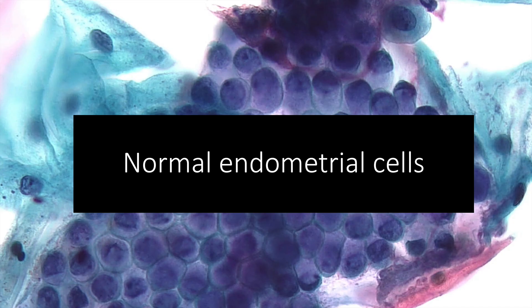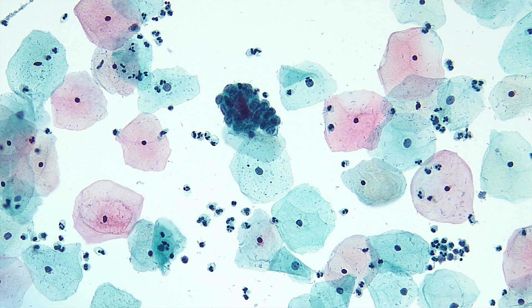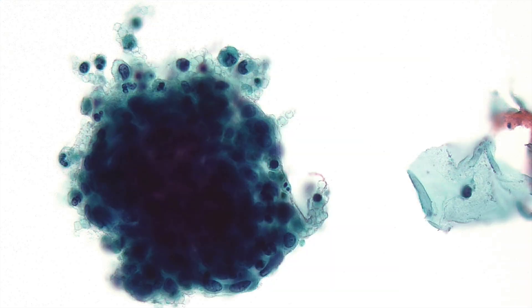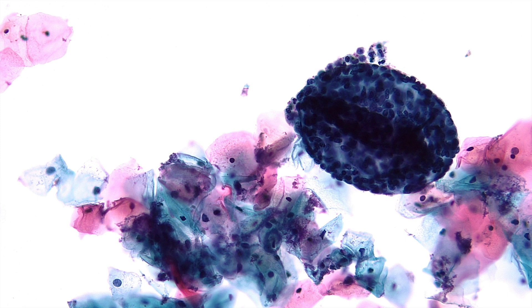Now we'll discuss normal endometrial cells. Normal endometrial cells are smaller than endocervical cells, with nuclei about the same size as an intermediate squamous cell. The nuclear chromatin can be dense and heterogeneous, and does not contain prominent nucleoli. These cells have scant cytoplasm. Intracytoplasmic neutrophils are characteristic, and classically, endometrial cells shed in tight clusters called exodus.